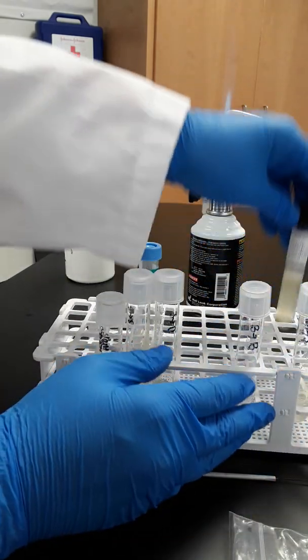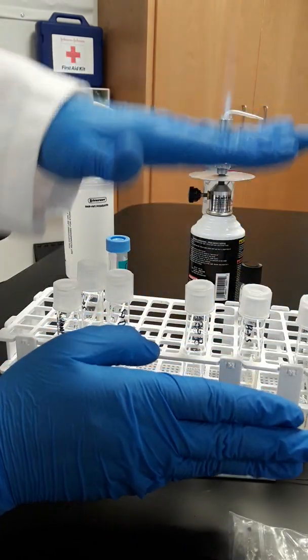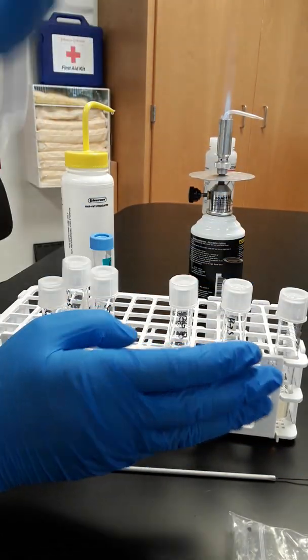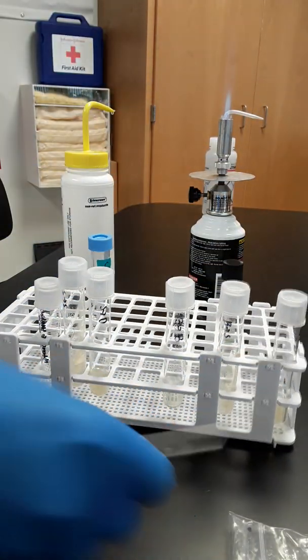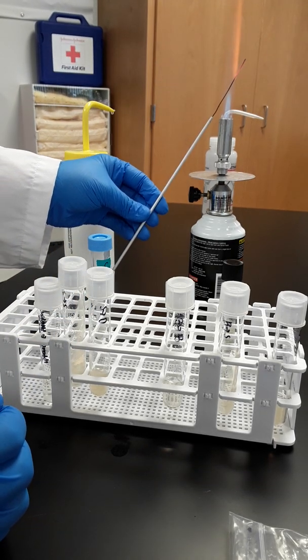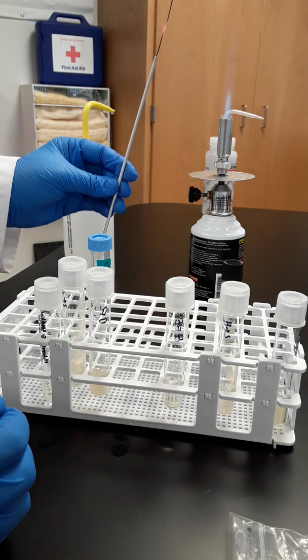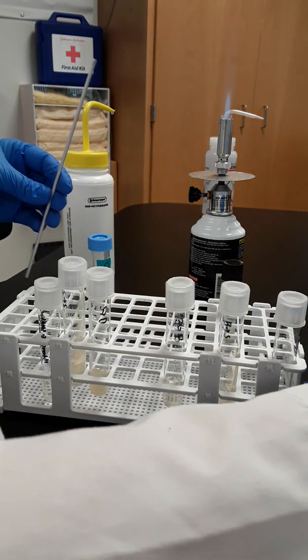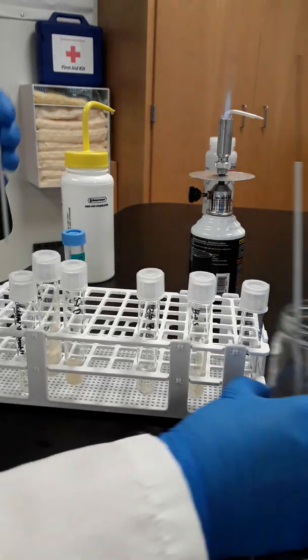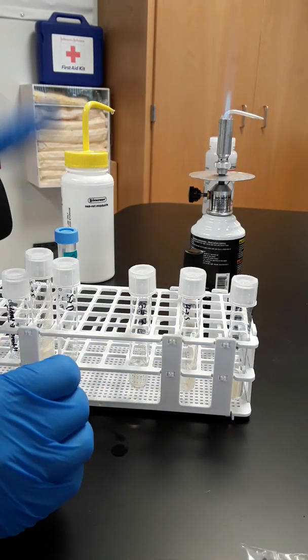So we have taken these three cultures, and they originated from a slant. These three cultures, they have originated from a broth. We have labeled them appropriately. We did not leave anything in the flame too long, and now we are done with the lab. So we are going to make sure that our loop is nice and sterile before we return it to whence it came, which is the jar that looks like this, so the next person has a nice clean loop.